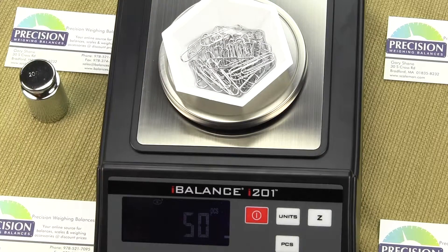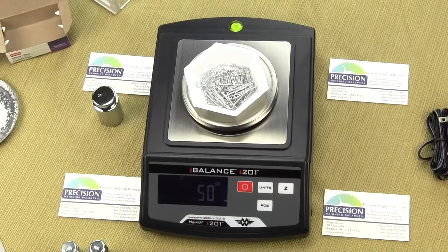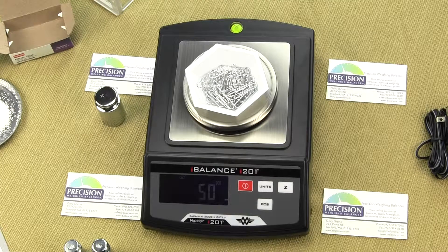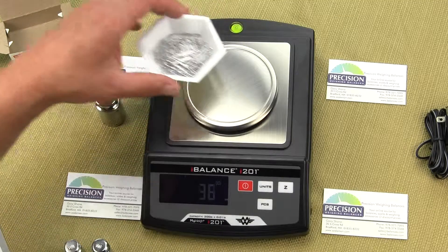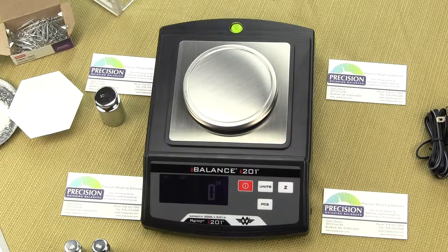One rule of thumb: the smallest part you're counting should be 4 to 5 times the readability of the balance. This balance goes to 0.01 grams, so your part should be at least 0.04 or 0.05 grams to use the parts counting function efficiently. Rhinestones, for example, all have different weights, so there's no way to count them — you need something with a consistent weight. Paper clips have a tight tolerance. Also, grease or oil on nuts or screws can cause weight variation and affect counting accuracy.